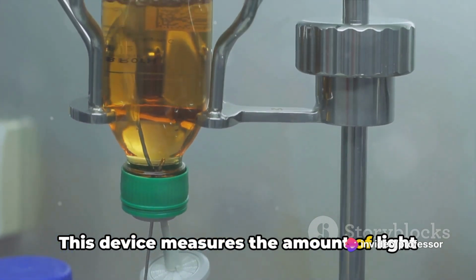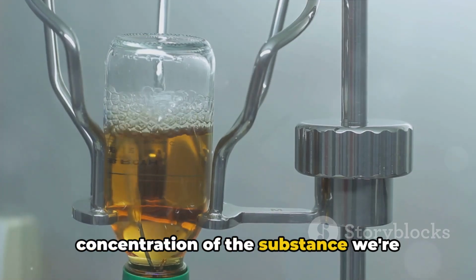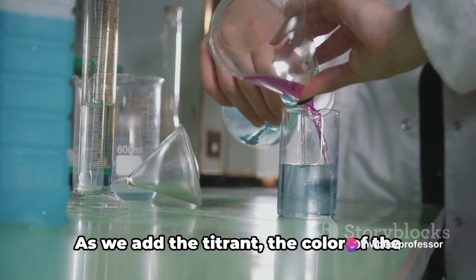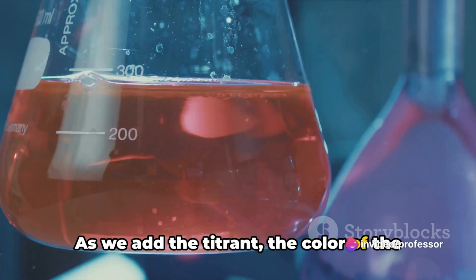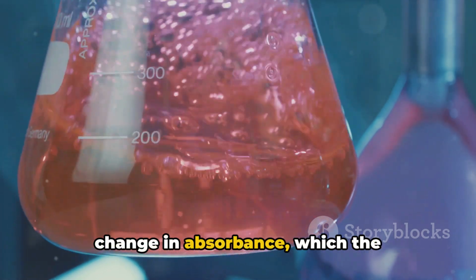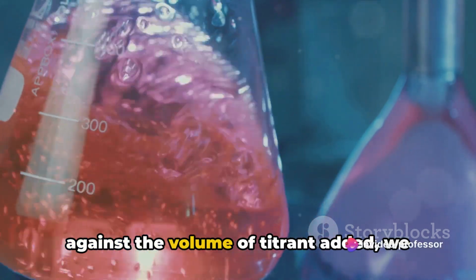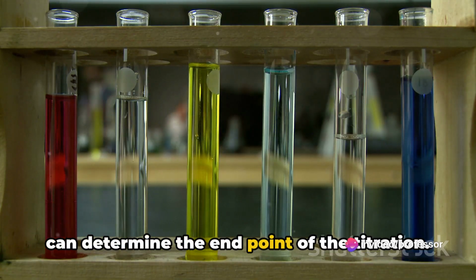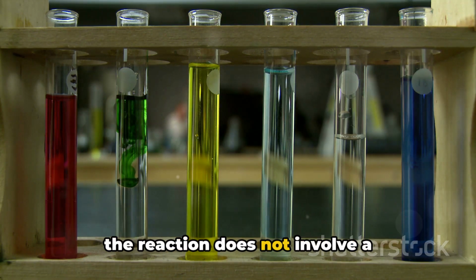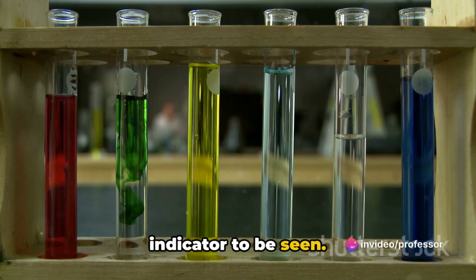This device measures the amount of light that a sample absorbs. By doing so, we can determine the concentration of the substance we're interested in. Now let's imagine we're titrating a solution of a colored substance. As we add the titrant, the color of the solution gradually changes. This change in color corresponds to a change in absorbance, which the spectrophotometer detects. By plotting the change in absorbance against the volume of titrant added, we can determine the end point of the titration. This method is particularly useful when the reaction does not involve a significant change in pH, or when the solution is too cloudy for a normal indicator to be seen.